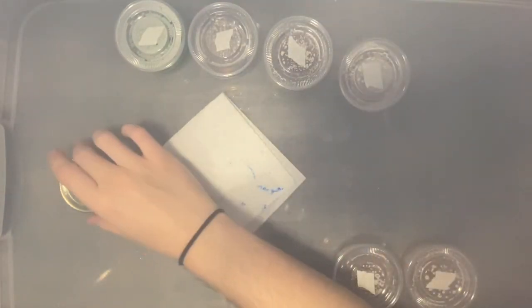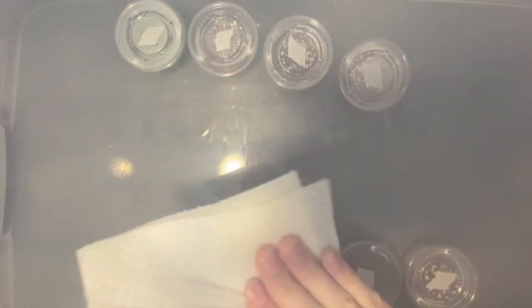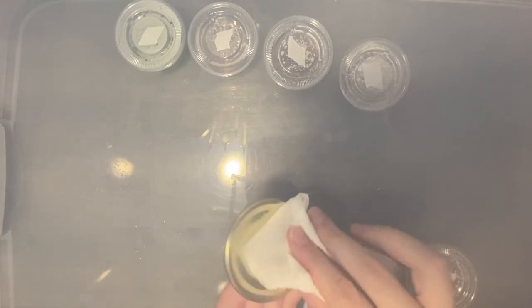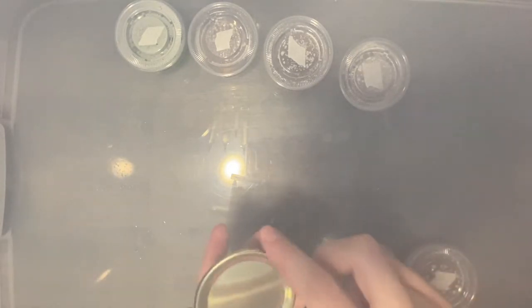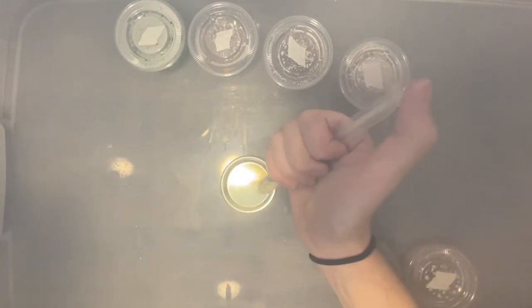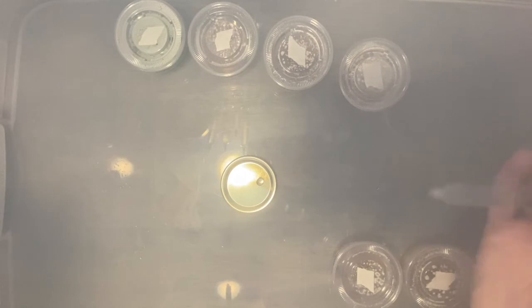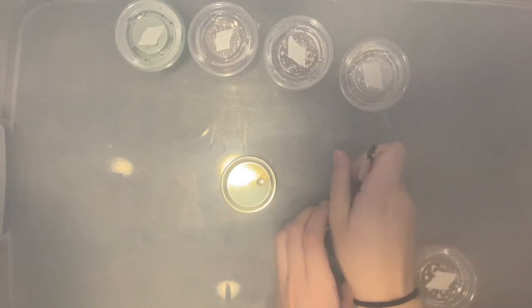All right, so this currently has some isopropyl on the top of it. I'm gonna wipe that down, and then I want to give it a little bit to evaporate. I'm gonna drop a couple drops. That's probably too much, but we're good. Now this one is perfect.